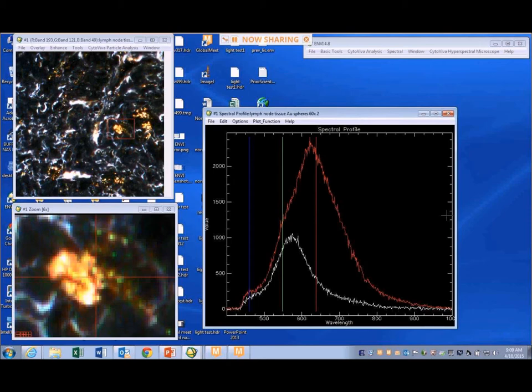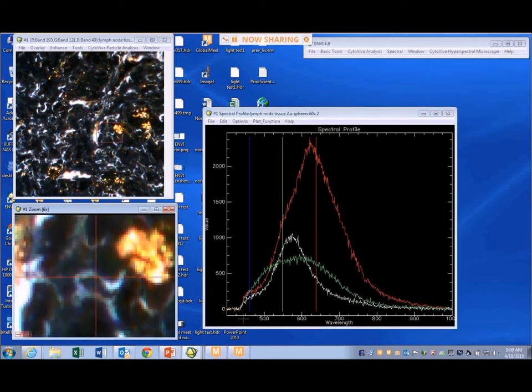As she goes off into an area where there is no gold visibly present, you see a dramatically different spectral curve for the tissue only. Just as with the silica nanoparticles, the tissue spectrum is much reduced in intensity compared to the gold nanoparticles.